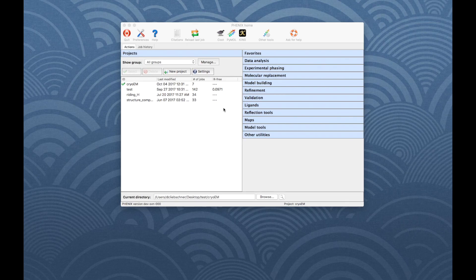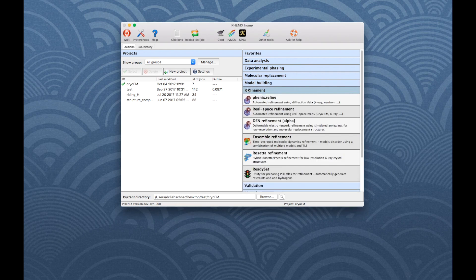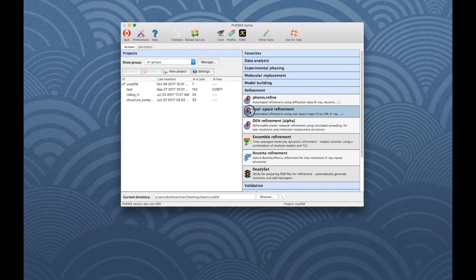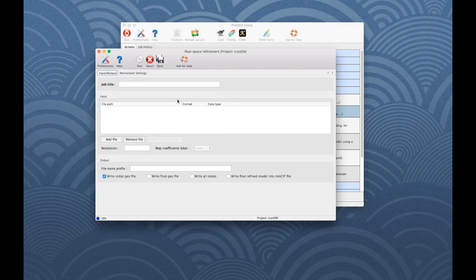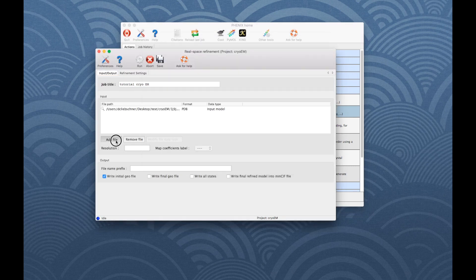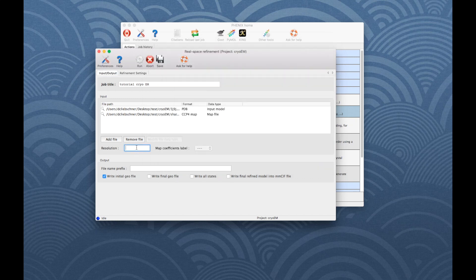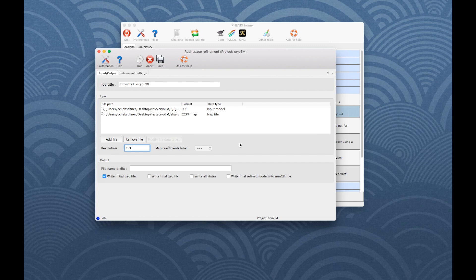The next step is to perform refinement. The program Realspace Refine can be found under Refinement, then choose Realspace Refine. Minimal inputs are a model file, a map file and the resolution. Refinement options can be changed in the Settings tab. Please note that a more detailed tutorial for Realspace Refine is available on this channel.